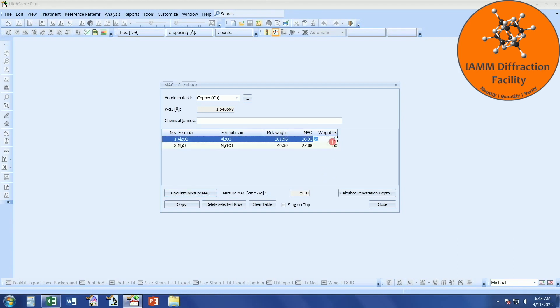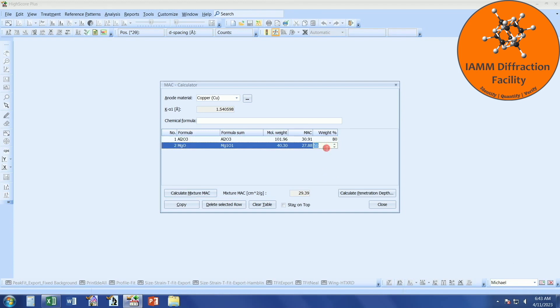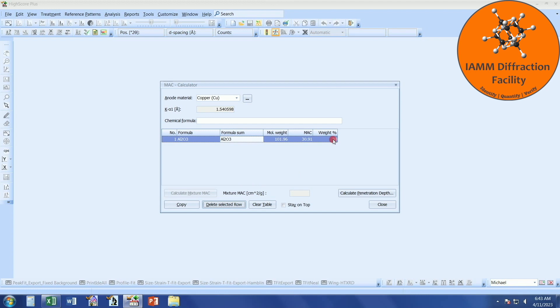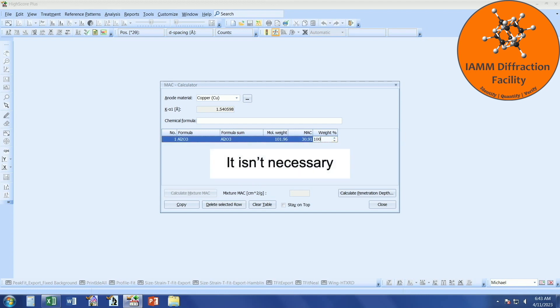I could also change this — maybe 80% of one and 20% of the other. If I click this button again, we see this value changes based upon the new weight percentages. For this example, I'm just going to stick with aluminum oxide, so I will delete that row and change the weight percent to 100.